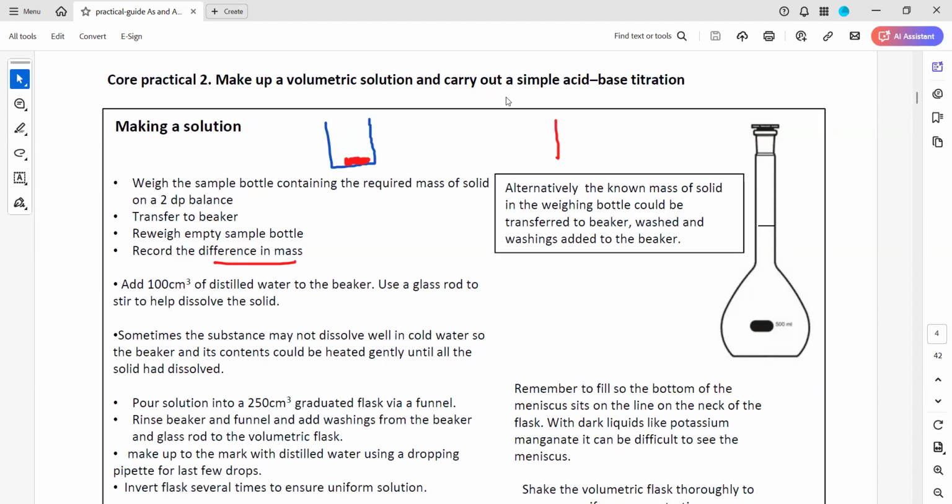Usually acids and alkalis in the lab are not aqueous. The alkalis we use, for example sodium hydroxide or potassium hydroxide, are white pellets. So first we have to make a solution. How do we make a standard solution for these?